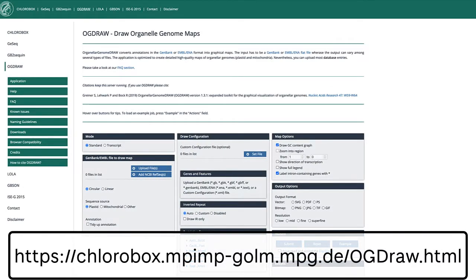OGDRAW takes GenBank or EMBL annotations of circular genomes, such as the chloroplast plastid, and generates graphical maps.